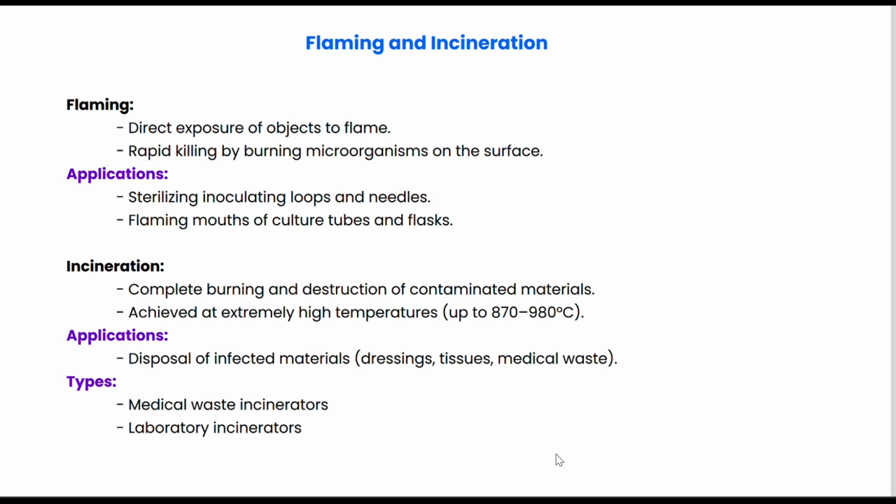Next, we have incineration, which is the complete burning of contaminated materials. Incineration is carried out at extremely high temperatures, sometimes up to 870 to 980 degrees Celsius, completely oxidizing and destroying microorganisms, toxins, and even the material itself.